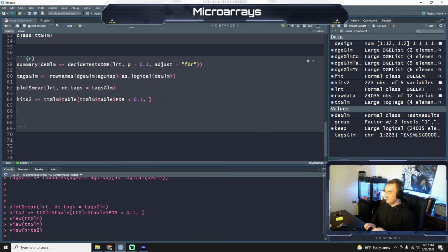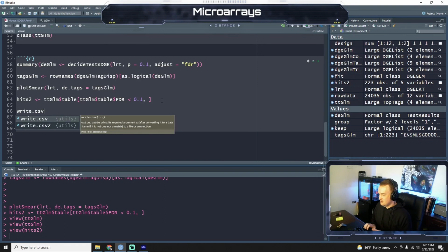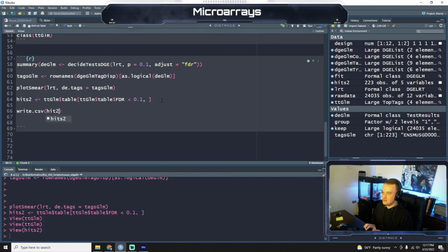Okay, so now let's write CSV hits2, and we're going to say mouse EdgeR results 0 versus 1.csv.